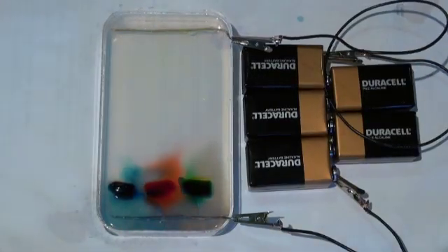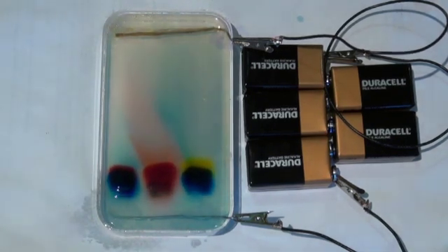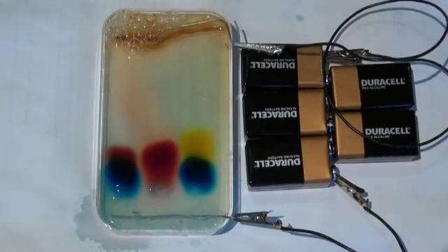Over the next 45 minutes, the electric current traveling through the gel will help us separate the dyes into their constituent macromolecular components. Because the macromolecules are different sizes, they travel at different speeds, resulting in visible separation into various colors.